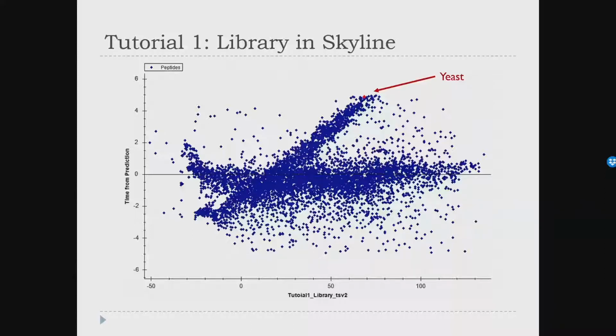And that was because it was collected fractionated, and there were a lot of peptides that only showed up in each fraction. Well, actually, it's fractionated by organisms, so we're looking at yeast, human, and E. coli data, and since they had collected, this was the yeast line, this was probably the human line, which was better.